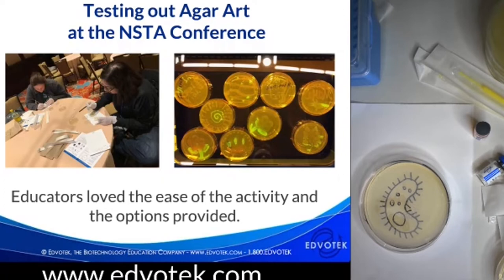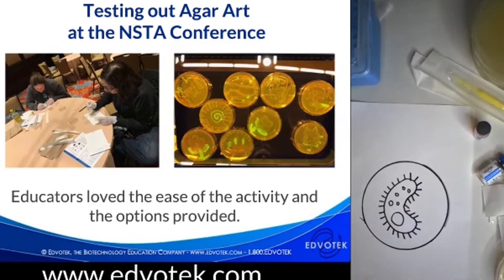These are some plates on our True Blue 2, which is our transilluminator. And you can see the colors and you can see the glowing from the GFP bacteria, and it looks really great. And so let me show you some of the plates that our lab did. You know, as I said, every time I do this workshop, our lab gets to do the results.